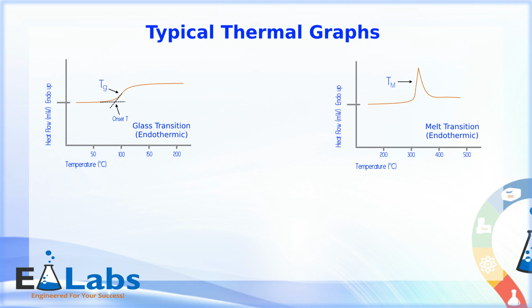to help in understanding. Data points of interest for this transition are the onset temperature, the total enthalpy, or area under the curve, and the peak height. Based on the look of a melt, what do you think a freeze transition would look like?